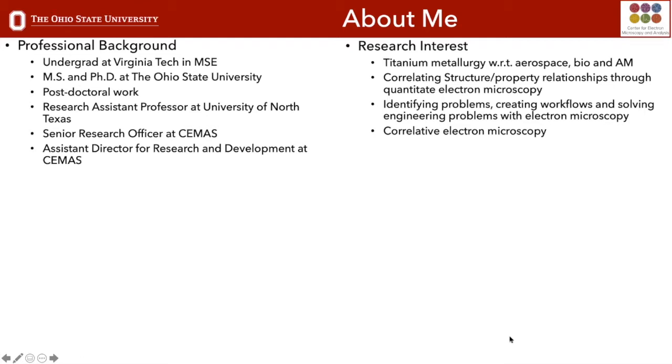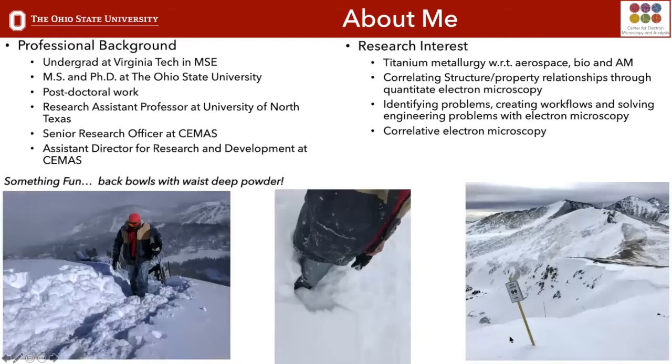They've become a little broader, but I like to try to correlate structure-property relationships by using quantitative electron microscopy. And then now, correlating electron microscopy with whatever type of material problems we can, and identifying workflows for industry to help them solve their problems.